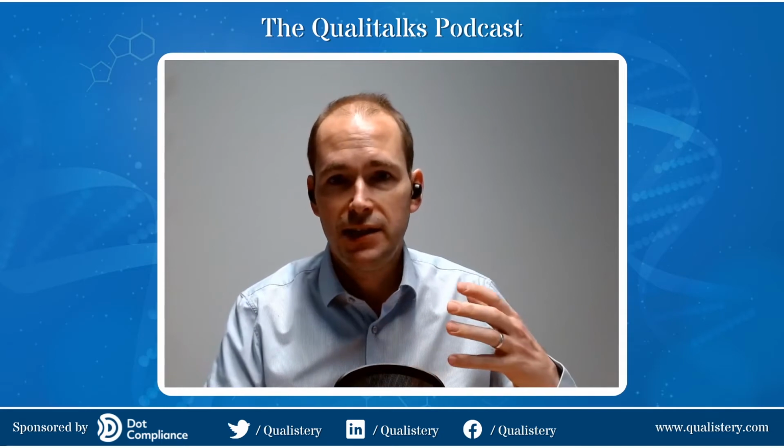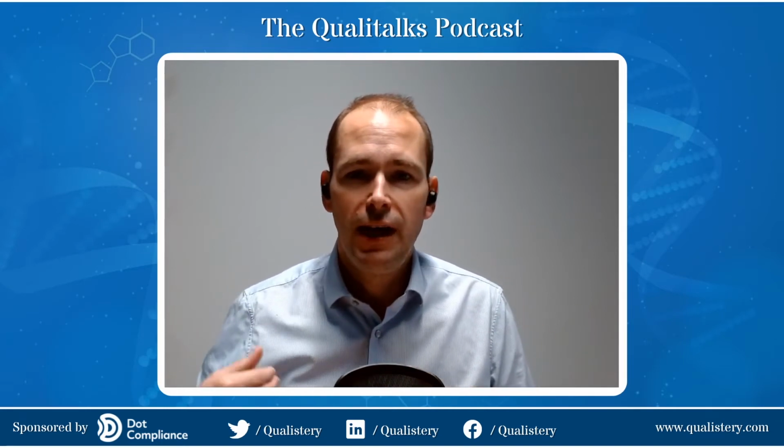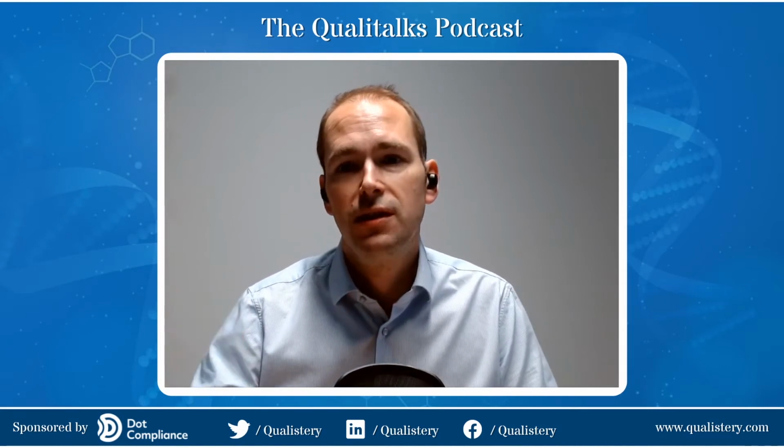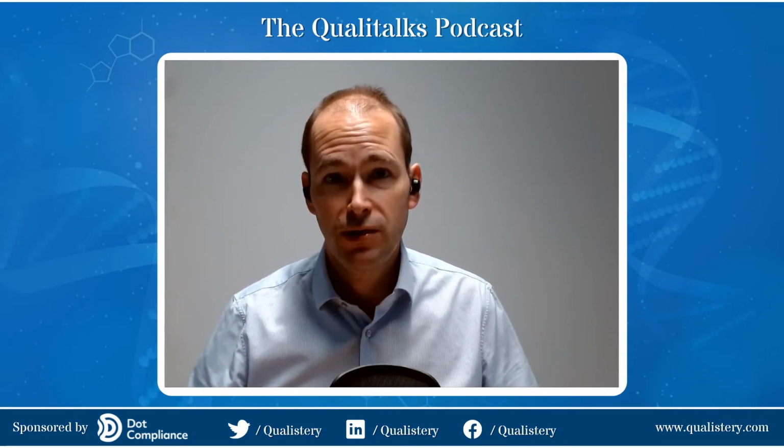What are the uses for autoclave? So let's go maybe a bit into general if we have more newcomers to the industry. So in the pharma industry, where do we use autoclaves? Okay, so we'll use autoclaves in the micro lab, for example. So that might be to sterilize any media that we're using within the micro lab. We'll use it within production to sterilize equipment that's used in creating the product. So it might be vessels, it could be filters, pipework, it could be forceps or anything that's used in the process during the production, and also the terminal sterilization of fluids products as well. So they'll go through the autoclave, and what we're looking to do is to kill any microorganisms that might be present within the load that goes into the autoclave.